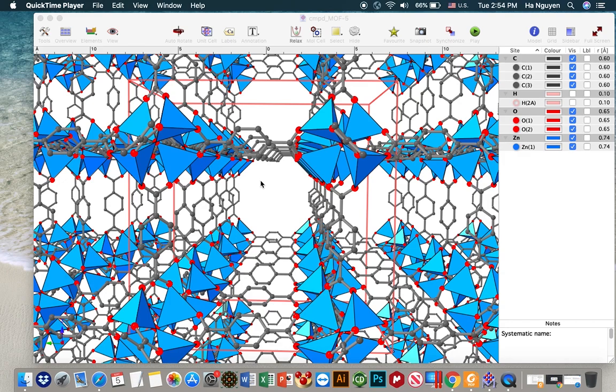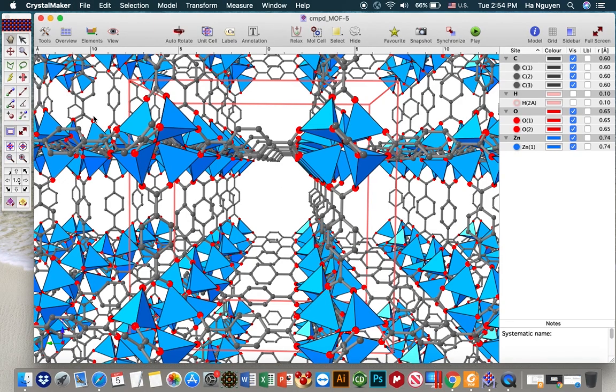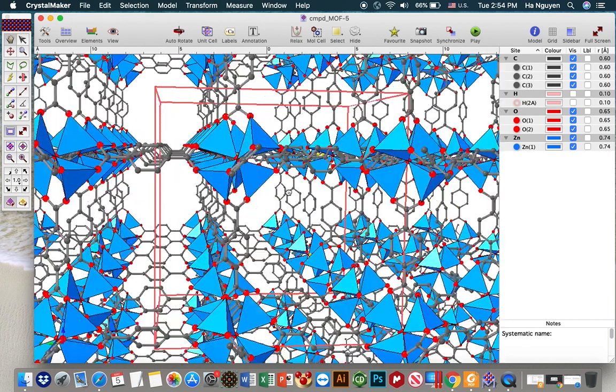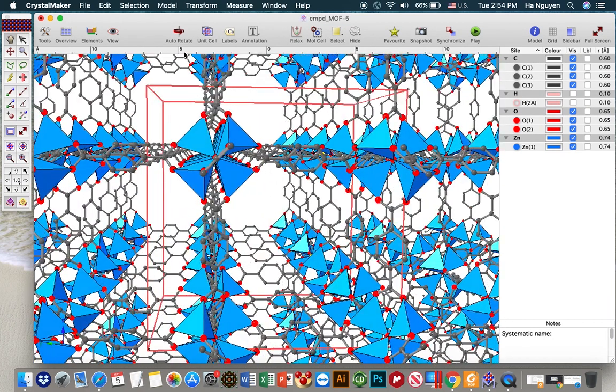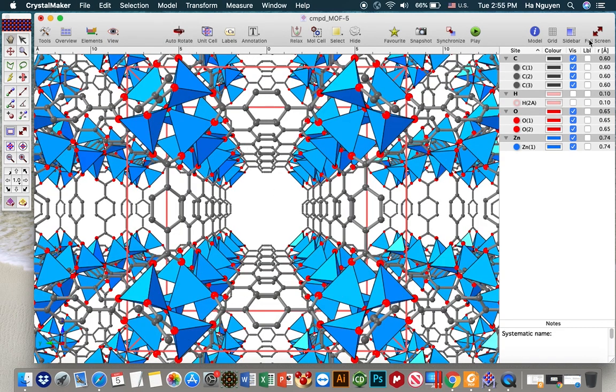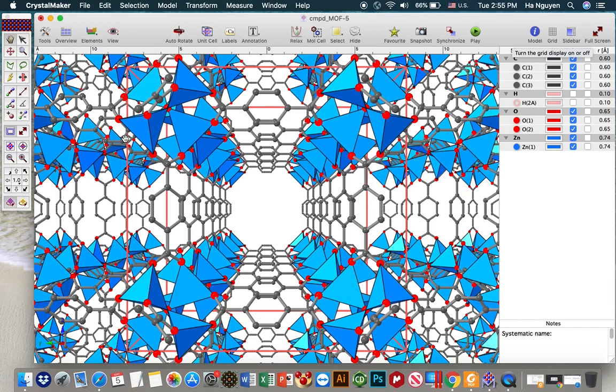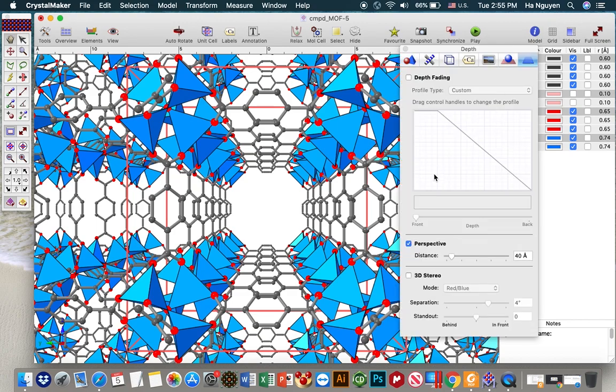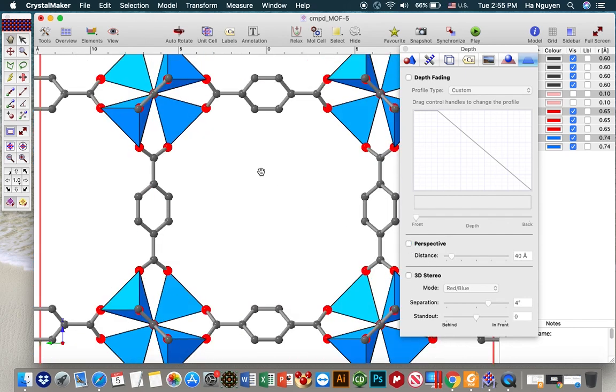So let's start with the previous file of the MOF file. So here is the structure. For example, we want to show a specific kind of region. So first of all, we put the structure at the A direction and then we move to the model and then I turn off the perspective.